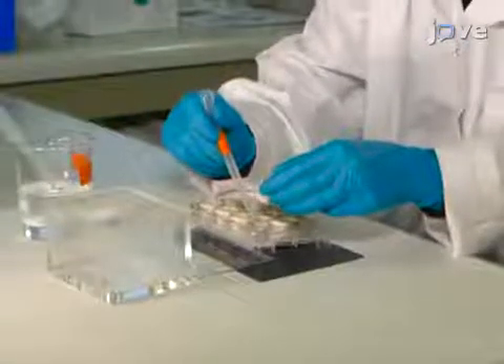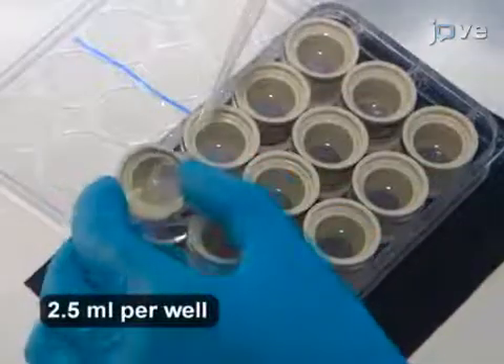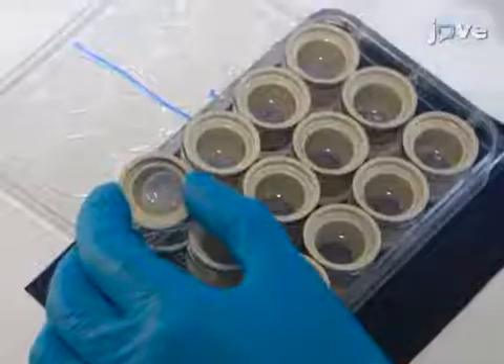To begin this procedure, wash the coronal brainstem sections for 10 minutes with 0.1 molar PBS at room temperature. Repeat the wash three times.